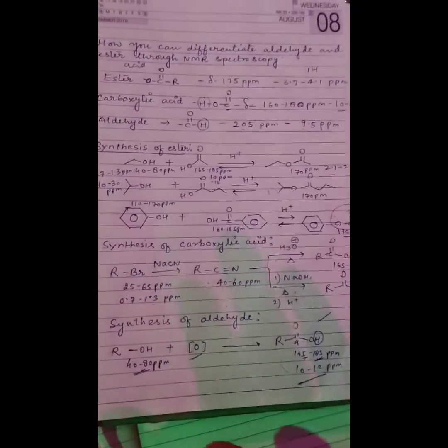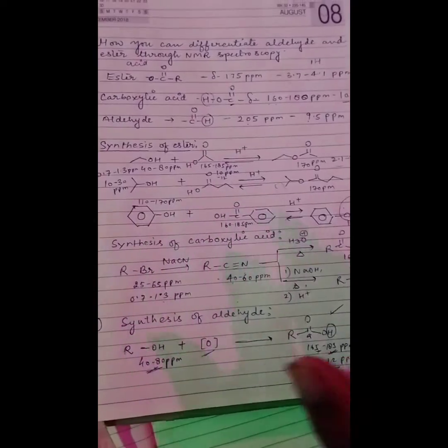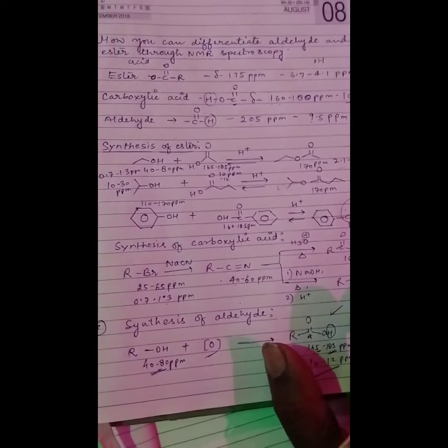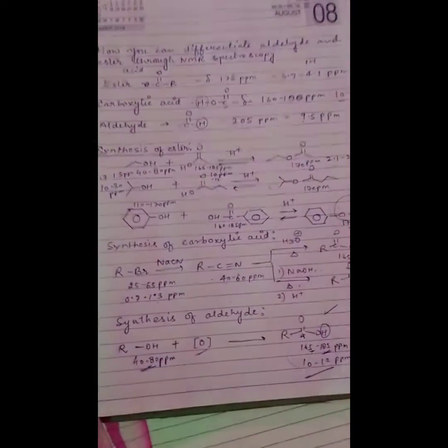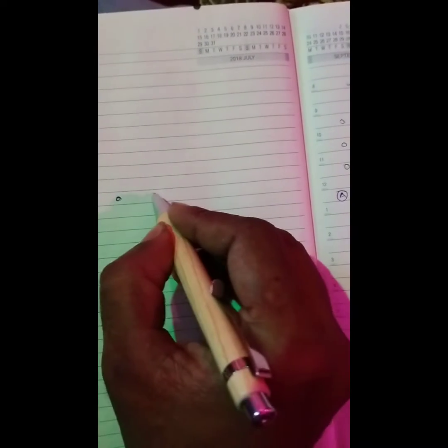So these are some of the questions actually solved in this lecture. The first one is how you can differentiate aldehyde, ester and acid through NMR spectroscopy, and how you can synthesize them in the lab. I will also discuss that during the synthesis, first of all you should know what the precursor is.